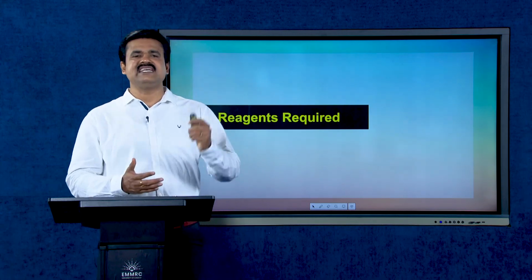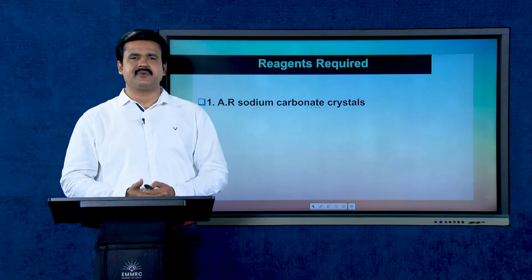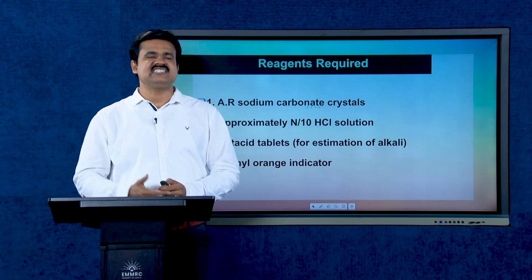Now, reagents required for the present experiment. The reagents required are AR sodium carbonate crystals, approximately N/10 hydrochloric acid solution, antacid tablets for estimation of alkali, and methyl orange indicator for performing the titration reactions.